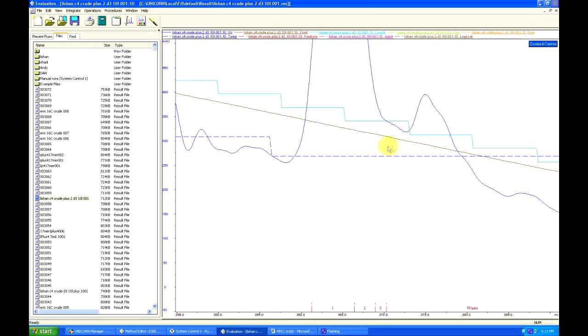Right clicking and choosing marker makes a marker appear showing you the intensity of the peak at any point the marker lies on. Left clicking the other line components, such as the lime colored percent B line, now changes the marker into a lime color and will show you the percent solvent B of any position on a peak. This tells you at what percent B a peak elutes, which is useful for future runs of this specific sample.